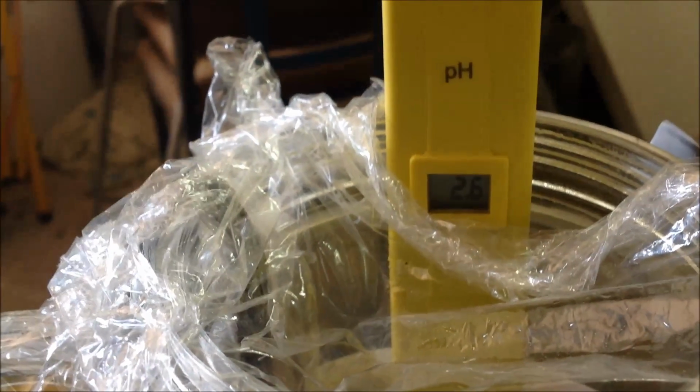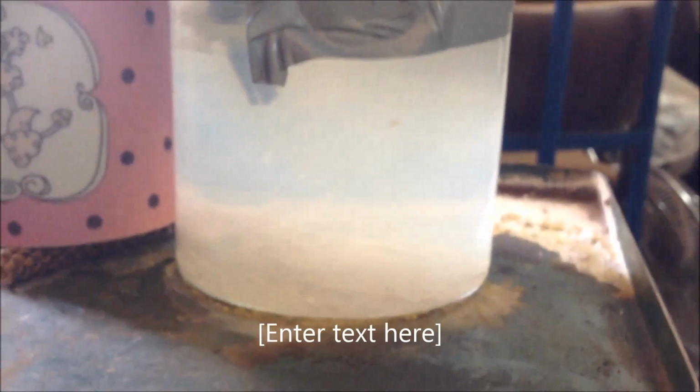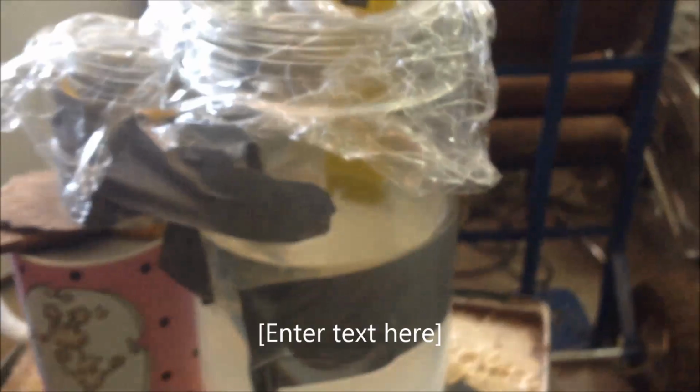Now the interesting thing is that after 2 weeks, and let's see if I can get this in the shot. Now pH is sitting only at 2.6 after 2 weeks. So even with it going that slowly, there is some kind of precipitate there. We'll stay tuned, we'll take that up to 8.5 and see how long it takes.